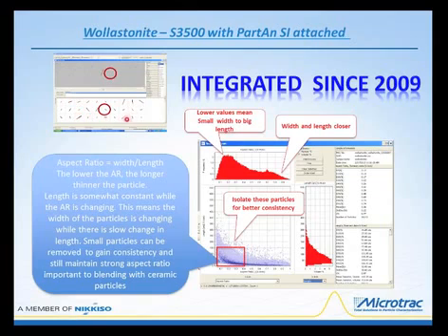And we can see there are lots of needles. Now, I can't show you all the particles, because on the order of 600,000 particles have been measured throughout this measurement. So we're getting a really, really good look at the shape information.